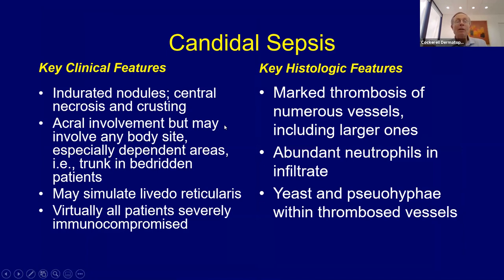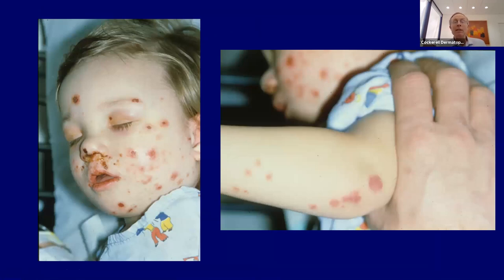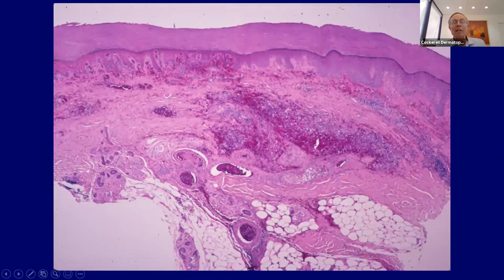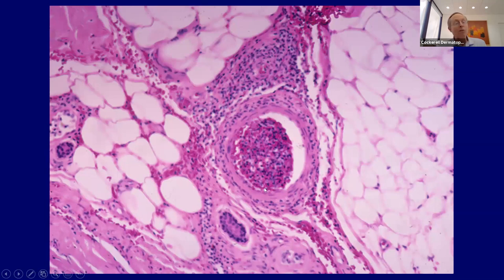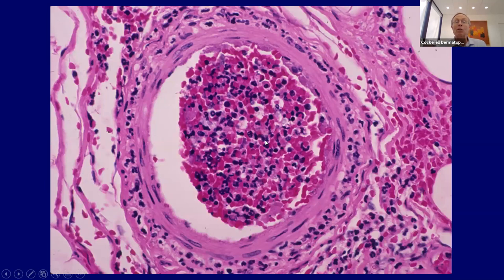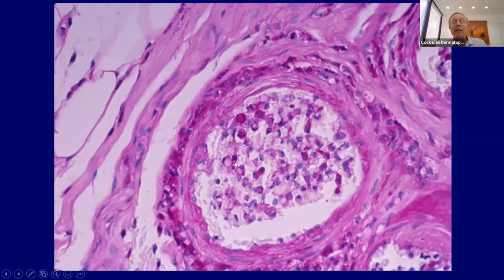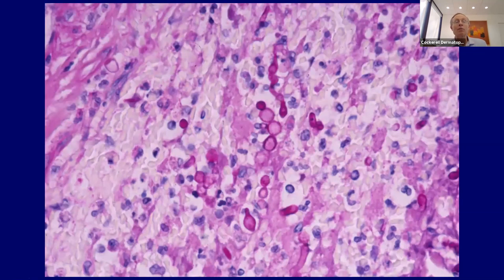Candida sepsis — here you're getting fungemia. Same sort of thing, but instead of bacteria, fungi cause the blood vessel thrombosis. Usually a very bad sign in severely immunocompromised patients, typically leukemic patients who are neutropenic. Here's a child with leukemia on chemotherapy — even the larger blood vessels down in the subcutaneous fat are thrombosed. Notice all the neutrophils are intact with no leukocyte eclasia, inside the vascular thrombosis. The PAS stain highlights all the candida organisms inside this plugged blood vessel. The organisms were also actually in the skin, budding and forming pseudohyphae in the dermis.